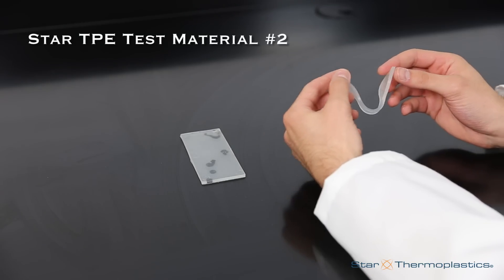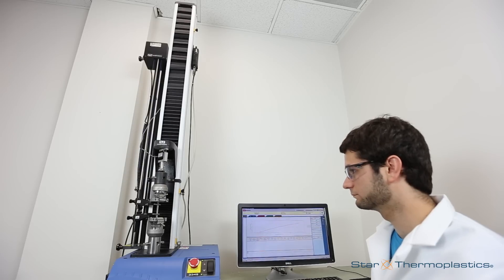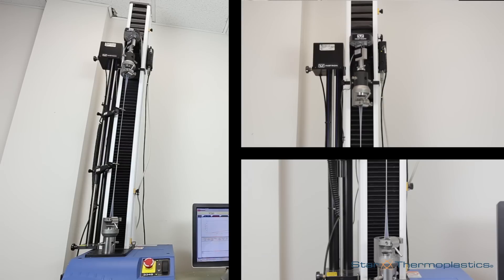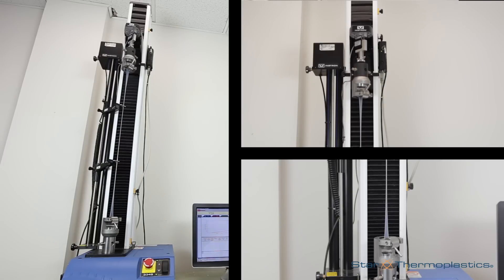And here's a soft gel-like TPE, used for applications such as bicycle seats, shoe insoles, or other soft skin contact parts. Because these applications don't typically involve the need for continuous stretching, their tensile strength can be much lower.